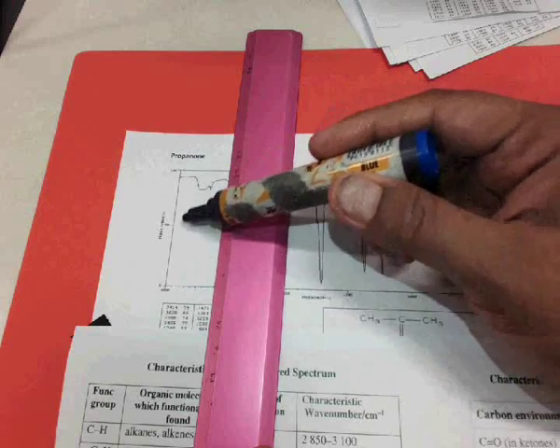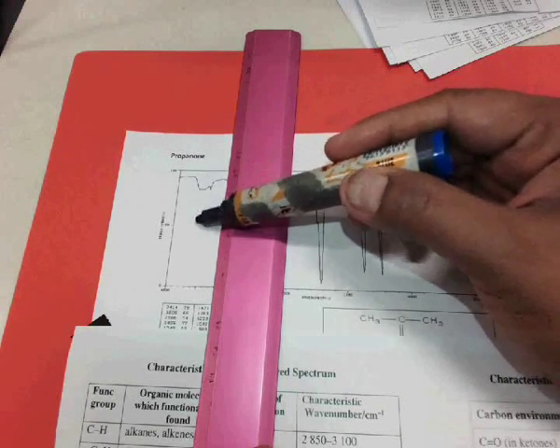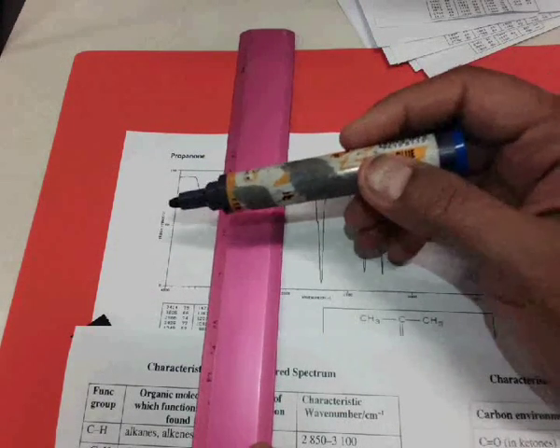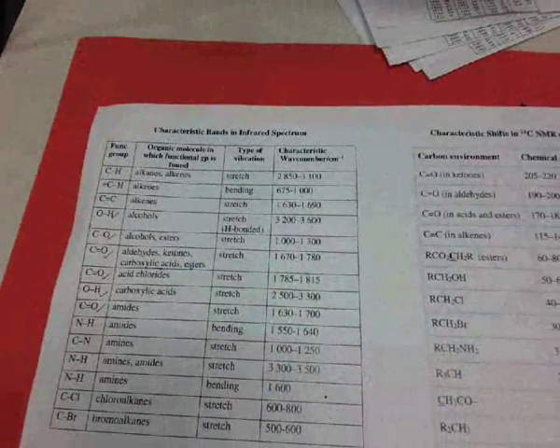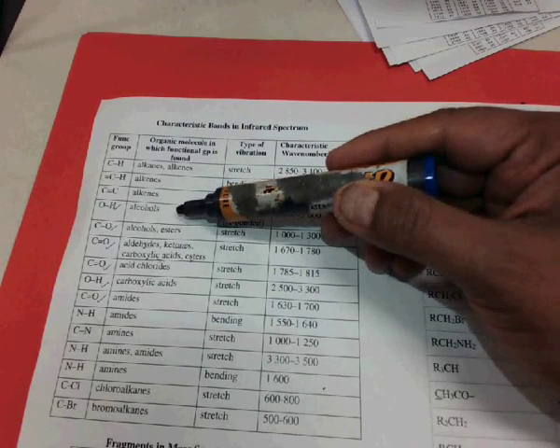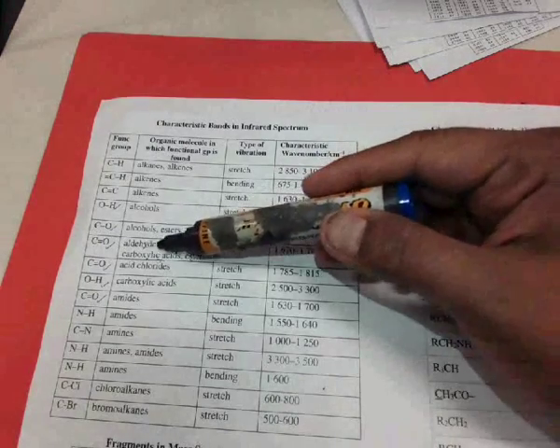I don't have any significant peaks over here. That is not so significant, so I can pretty much rule out that this is an alcohol. That just leaves me with the next bit on the data sheet, which says that if it's not an alcohol, then I'm looking for the next possible option, which is aldehyde or ketone.